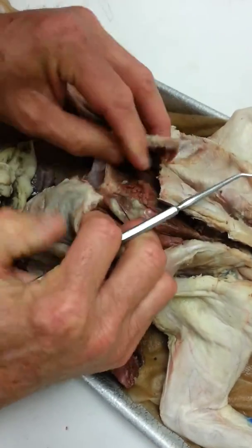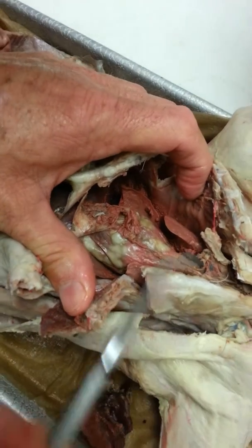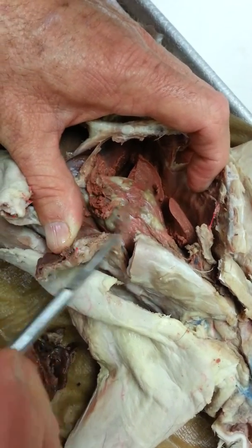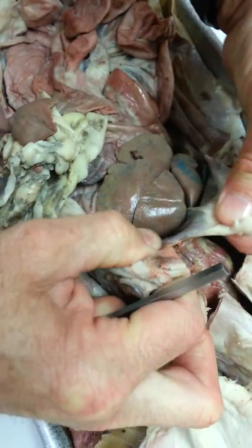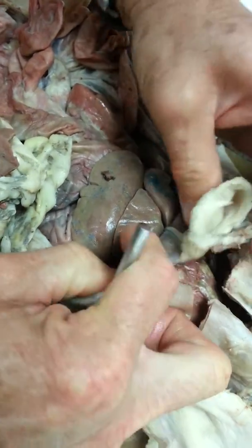Then here is the heart. The heart's kind of hard to see because the pericardial sac's still on it. I mean, it's not hard. You can't see the surface. All this is the heart here. That is part of the sac. And then down here lower, this structure right here is the diaphragm. Right here with my fingers. That's the diaphragm. Below the diaphragm is the liver.